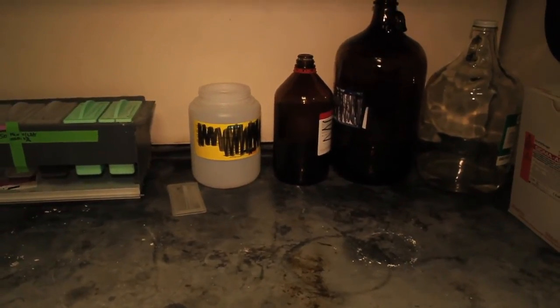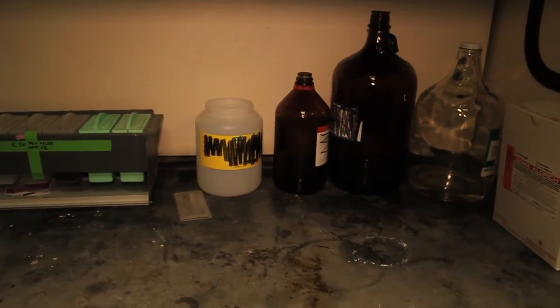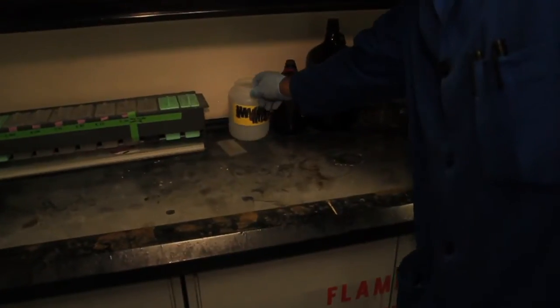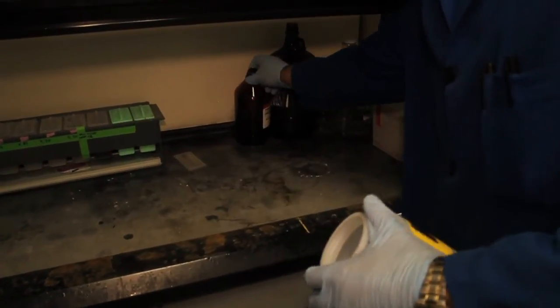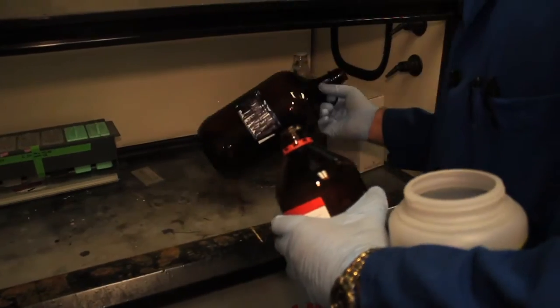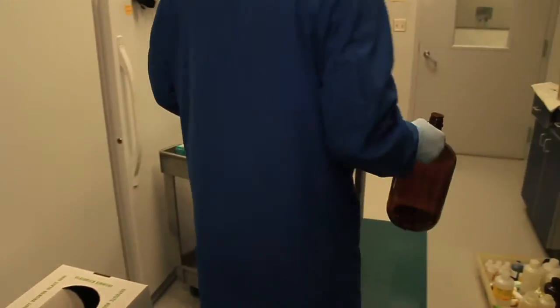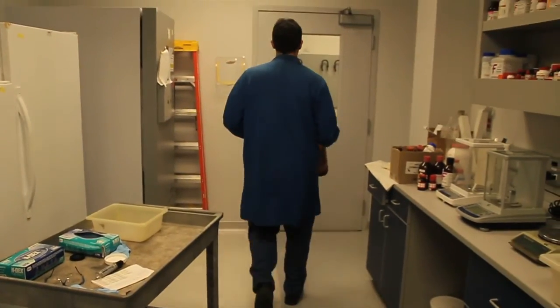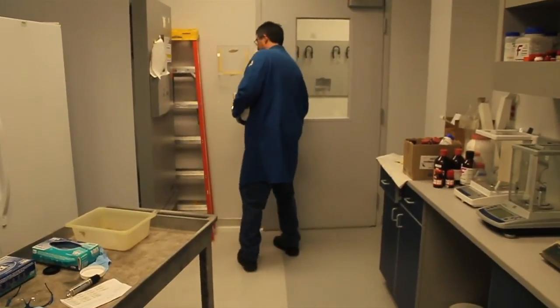After the large empty chemical containers are dry, they are ready for disposal outside of the lab. The janitorial staff will only take empty chemical bottles that do not have a lid, are completely dry, and do not have any chemical residue in them.